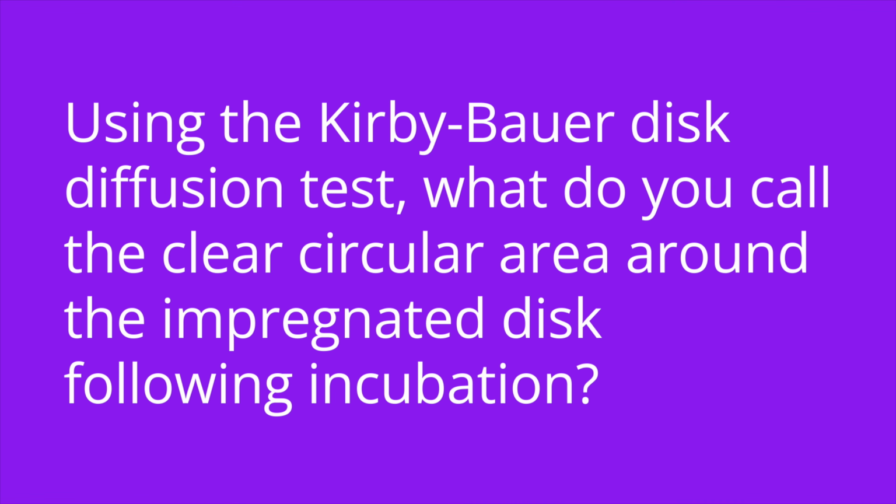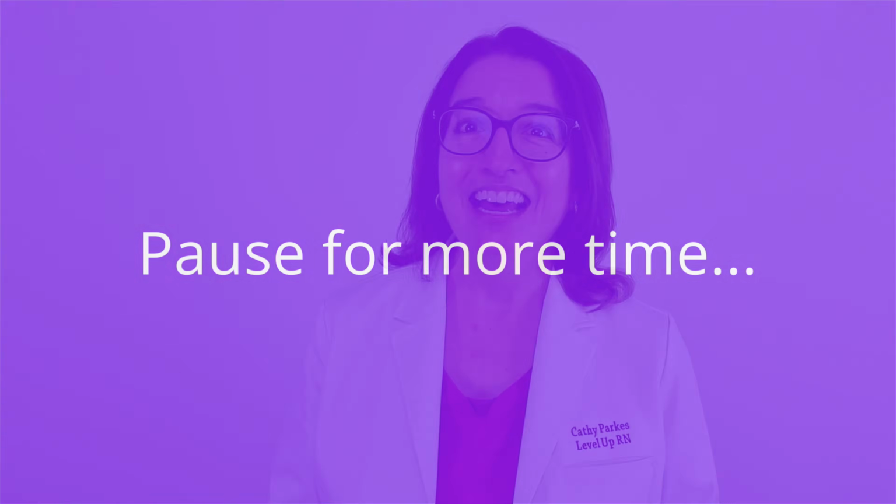All right, it's quiz time, and I have 3 questions for you. Question number 1, using the Kirby-Bauer disc diffusion test, what do you call the clear circular area around the impregnated disc following incubation? The answer is the zone of inhibition.